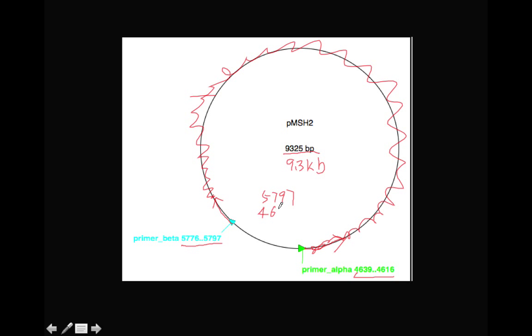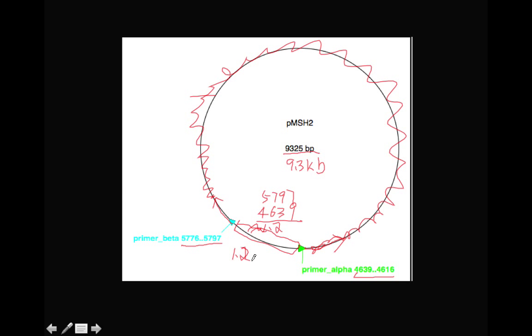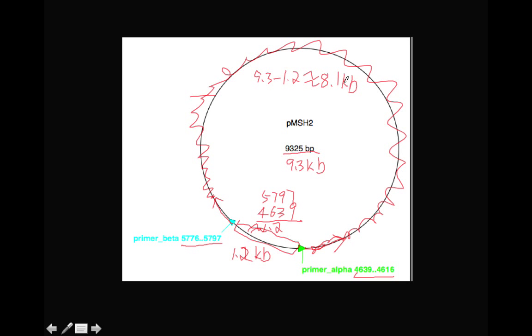And the primer position of this is about 4,600 to about 5,800. So this is about 5,797 minus 4,600. We first calculate how much this fragment is. This is a little easy. 4,639 and about 5.8. This is about 1.2 KB. And then the remaining part of this fragment will be 9.3 minus 1.2, which is about 8.1 KB. That's the first question.